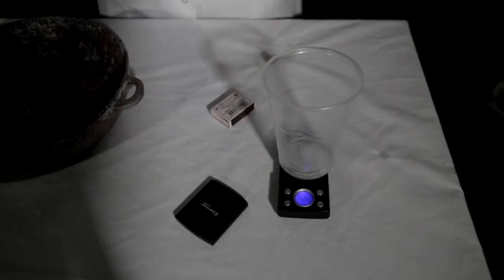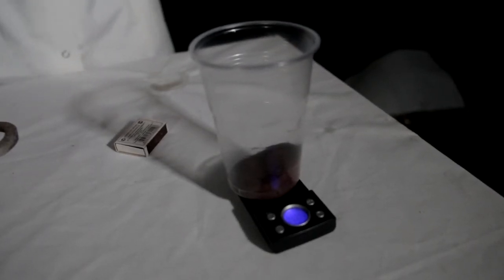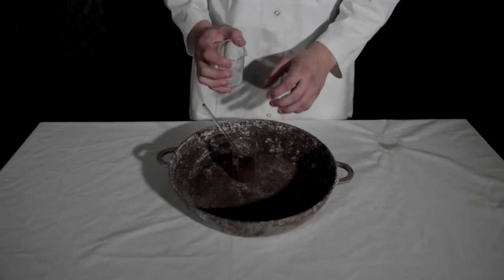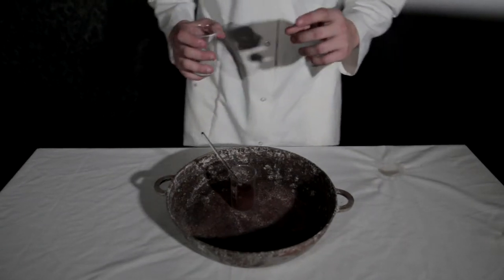Okay, so I am going to need the aluminum powder and the iron oxide in a ratio of 1 to 3. So I'm going to take 12.5 grams of aluminum powder and almost 37.5 grams of iron oxide. So in total I'll have a mass of 50 grams of the mixture. I'll mix them both, and this mixture is known as a thermite reaction. We are going to mix them properly and put the mixture into an iron pan with a thick bottom, because I'll explain why. It's an interesting process.